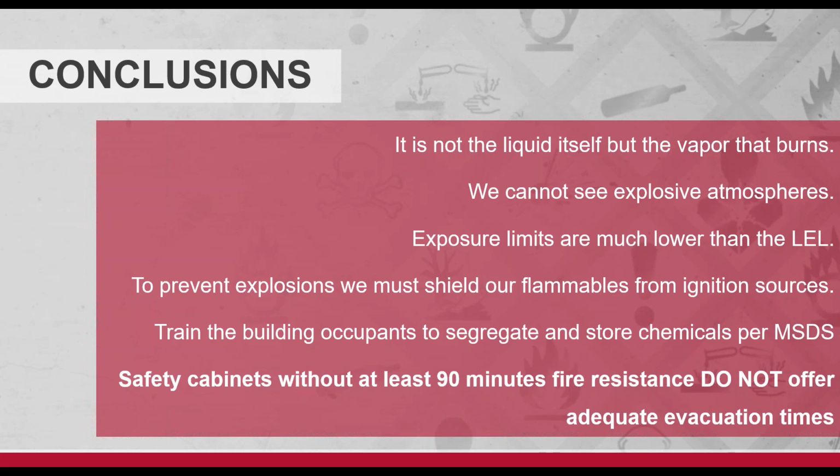Also need to ventilate everything we can. There's the joke, what is it? Dilution is the solution for pollution, right? Same idea in explosive atmospheres and things that'll hurt people. Ultimately, in your specs, right?